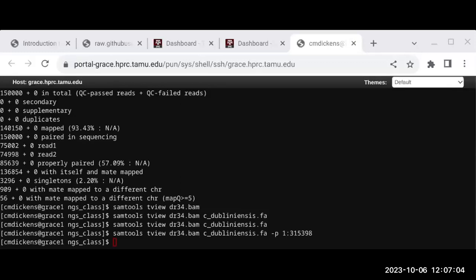All right, ChIP-seq. Just quickly, basically with ChIP-seq you're checking where a protein binds to DNA. So you have this antibody that recognizes that protein. It binds to the protein as it's bound to the DNA. That's this here, so we have this example of a protein binding to the DNA. Fragment all this. I'm missing an image here. I don't know what that is.